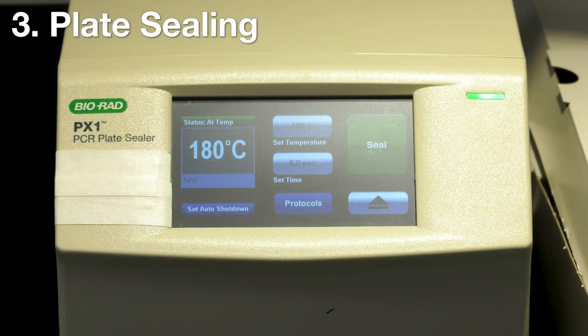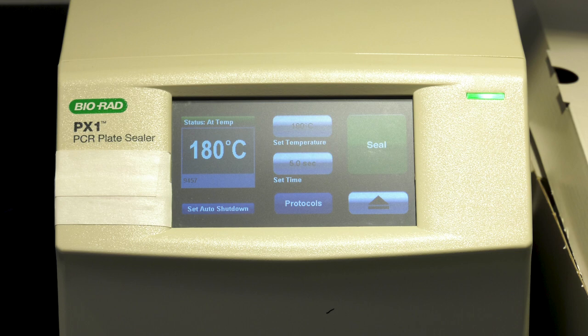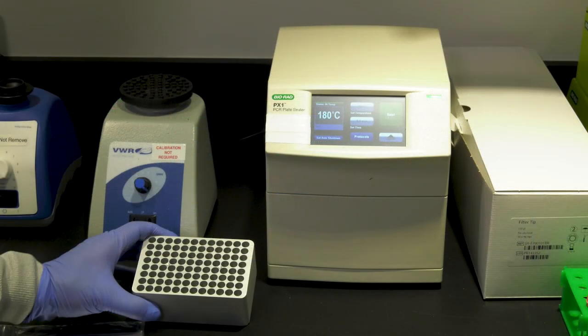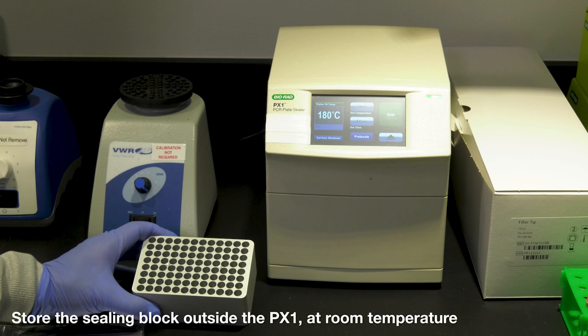We will be using the PX1 PCR plate sealer to seal our plate. For all digital PCR applications and the QX200 workflow, you should have the same settings for plate sealing, which are 180 degrees Celsius for 5 seconds. Before starting, it's important to ensure that the sealing block is at room temperature and not stored inside the sealer.